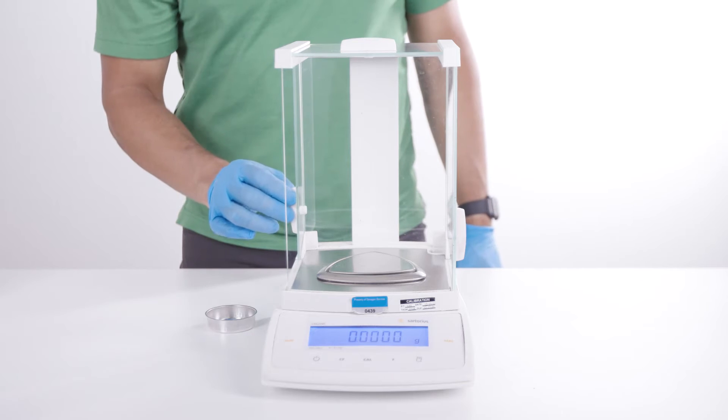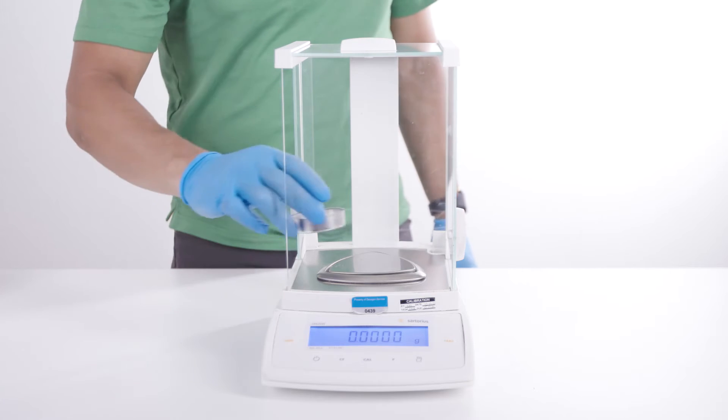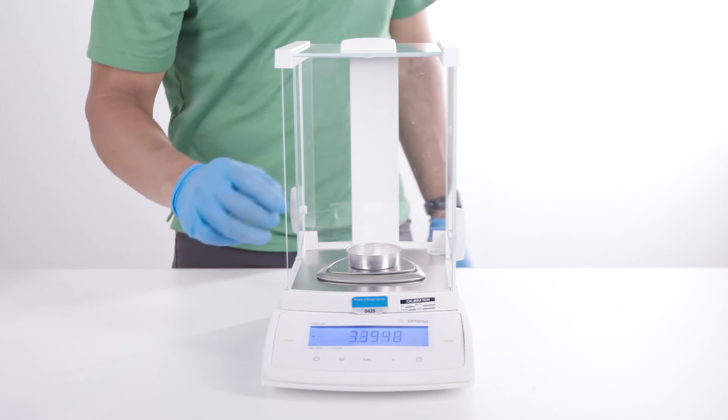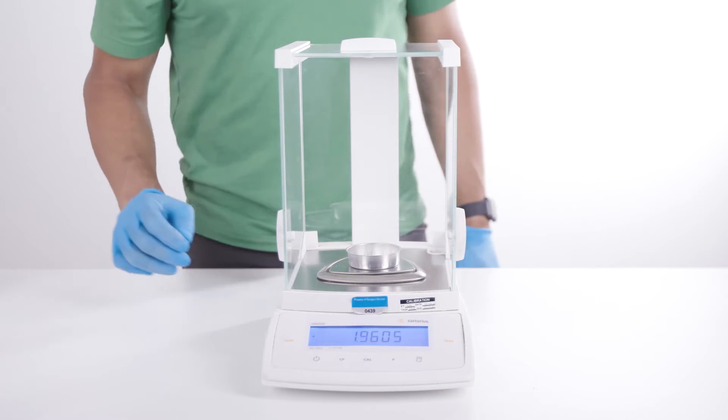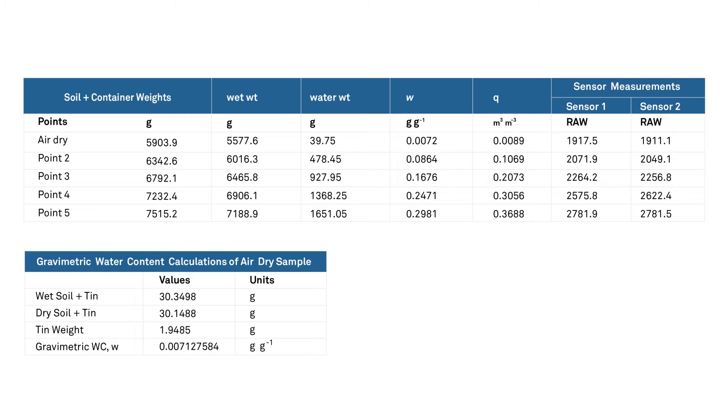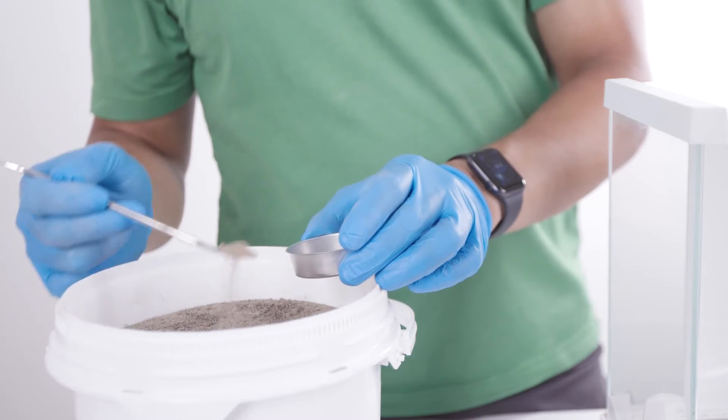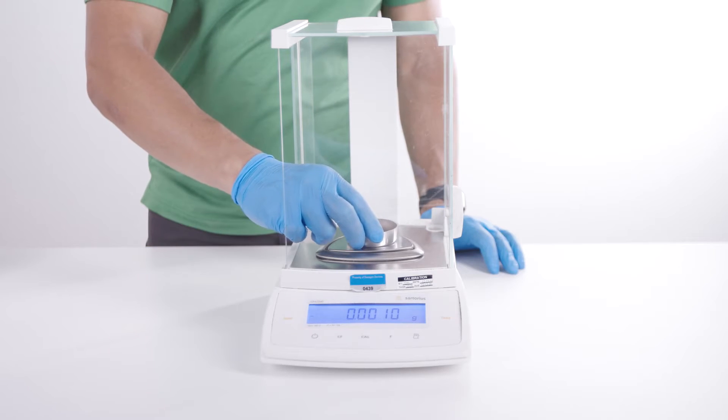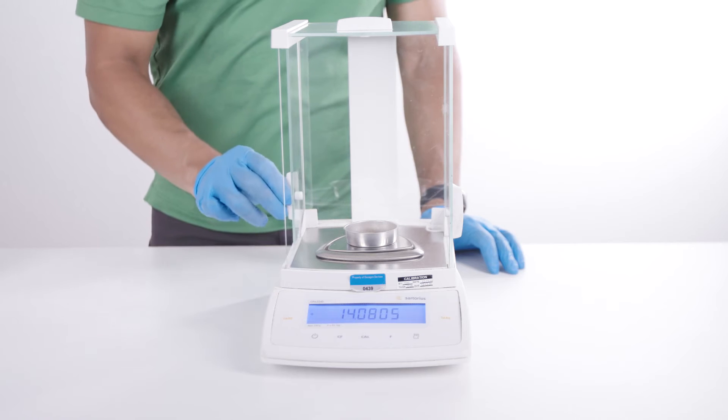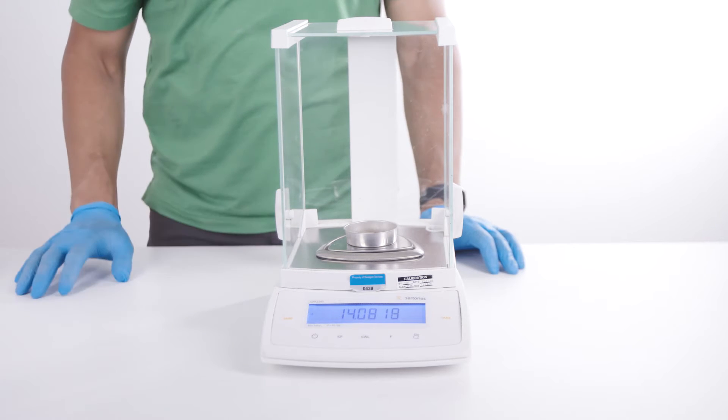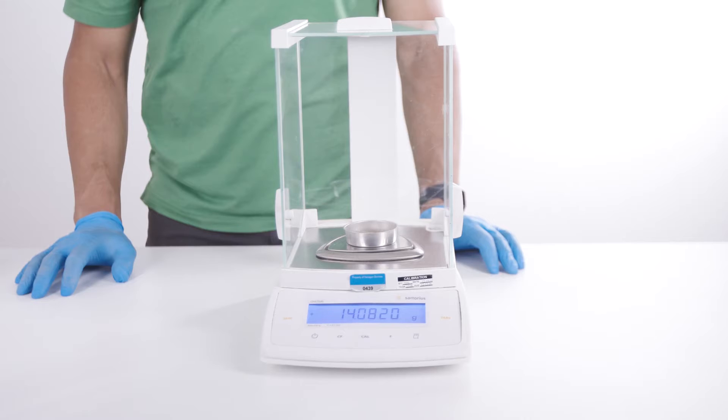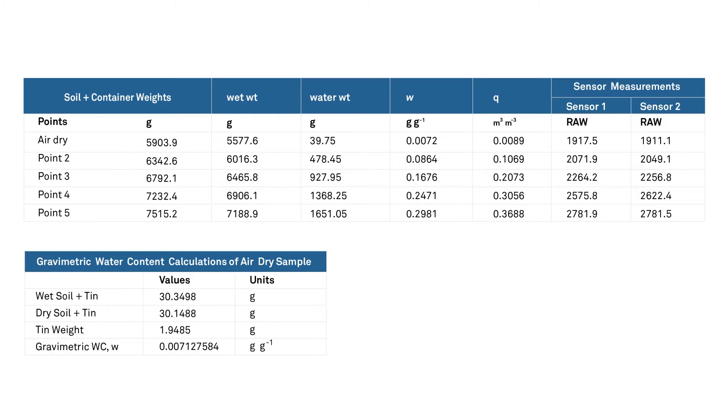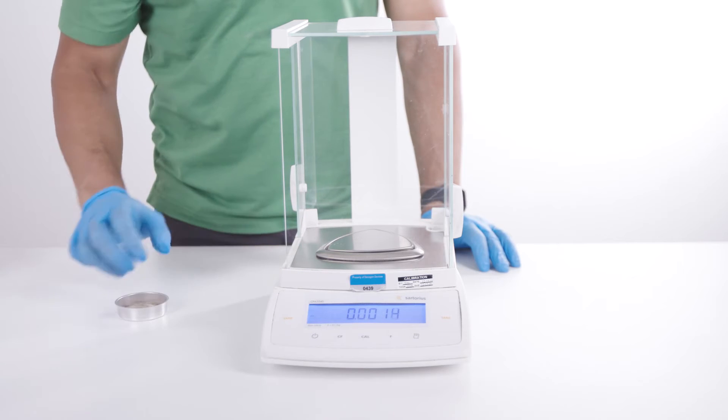To determine the initial air dry water content, take a small subsample. First, measure the mass of a clean dry soil drying container. Record the tare mass in Table 1. Remove 5 to 10 grams of soil with the spatula and place it into the drying container. To prevent water loss from the soil, immediately measure the mass of the soil plus the drying container. Record the weight in Table 1. Set the sample aside to be oven dried later.